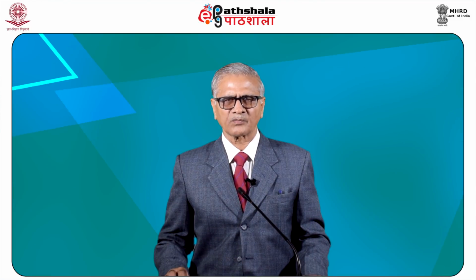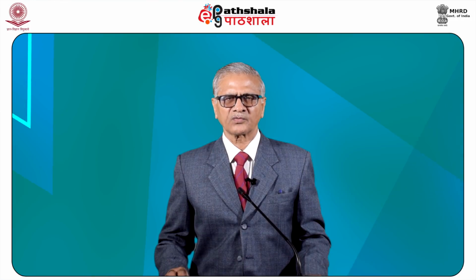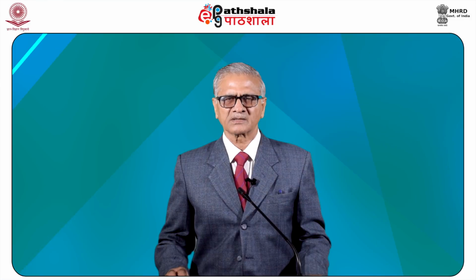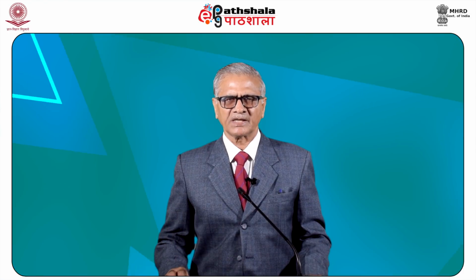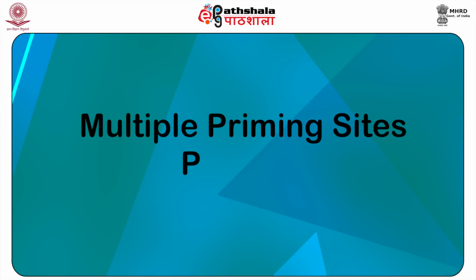Secondary base pairing along the DNA molecule restricts or prevents the movement of DNA polymerase along the DNA template at the point where a knot or fold is formed. These internal folds, which are formed due to base pairing between nucleotides within a single stranded DNA, are known as hairpin loops. These secondary structures can be opened up if a DNA relaxing agent such as betaine or dimethyl sulfoxide is used in the cycle sequencing reaction.